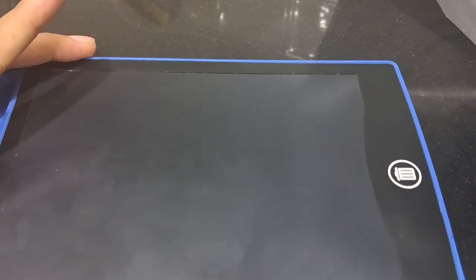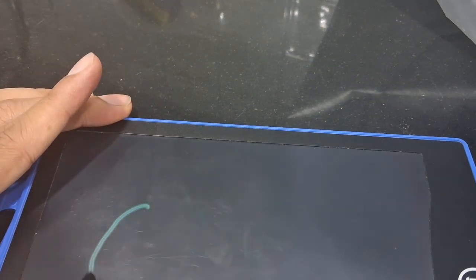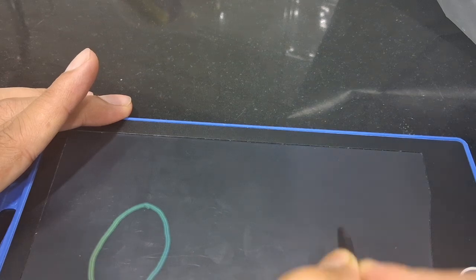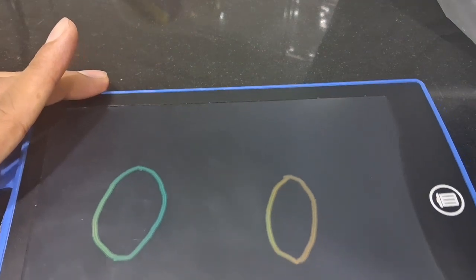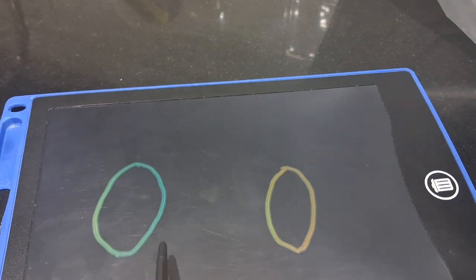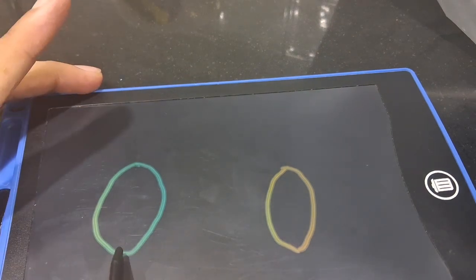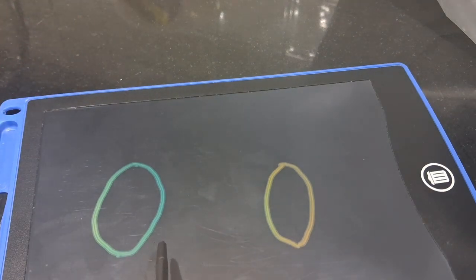So let me tell you first, here we have a gram-positive bacteria. You all need to know that bacteria have only a single cell. Both gram-positive and gram-negative will have a single cell, and the staining we are learning about, gram staining, only works because of the structure of the cell wall in gram-positive and gram-negative bacteria.